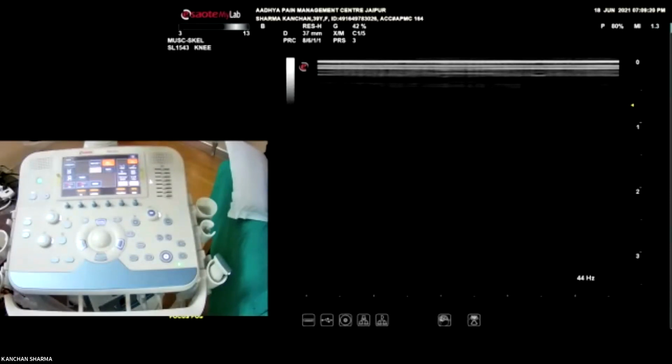Okay. Yes. So first we will understand the knobs, and then I will be demonstrating all the structures. Okay. So look at the cursor, which I will be moving. I hope you are able to see the cursor. Okay. So see this button. This is the scroll button. So this is going to take my arrow wherever I want. This scroll knob is this.